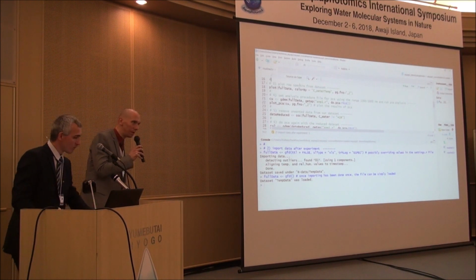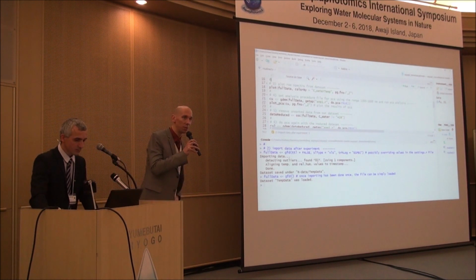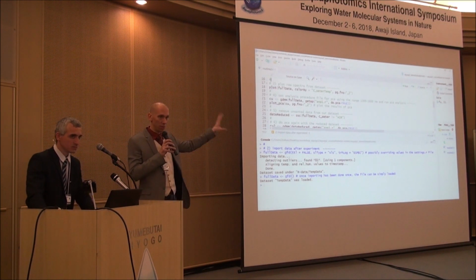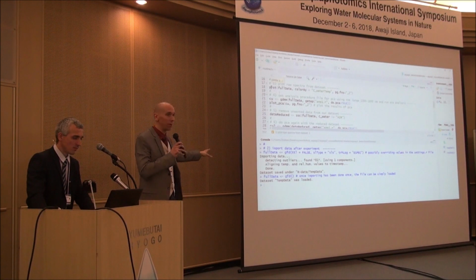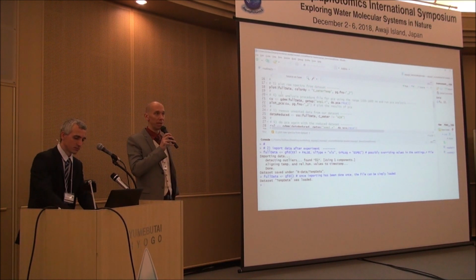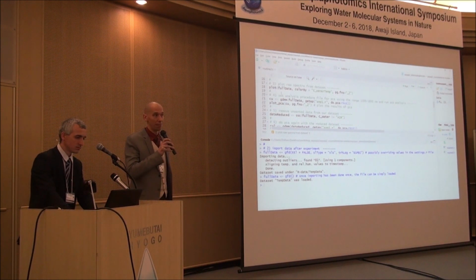Okay, I just really want to emphasize what Zoltan said. This is very important. All the importing and stuff, you only have to import it once, and then it is saved, and then you just load your aquap2 dataset and can play around with it. And this will be the majority of the time, of course.